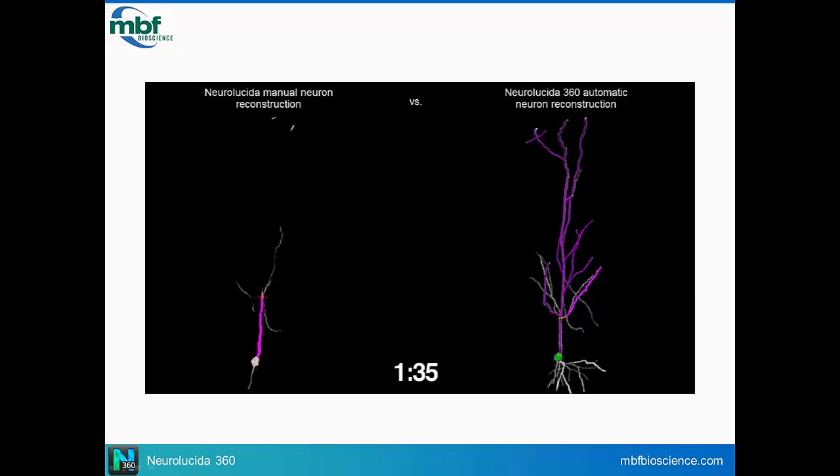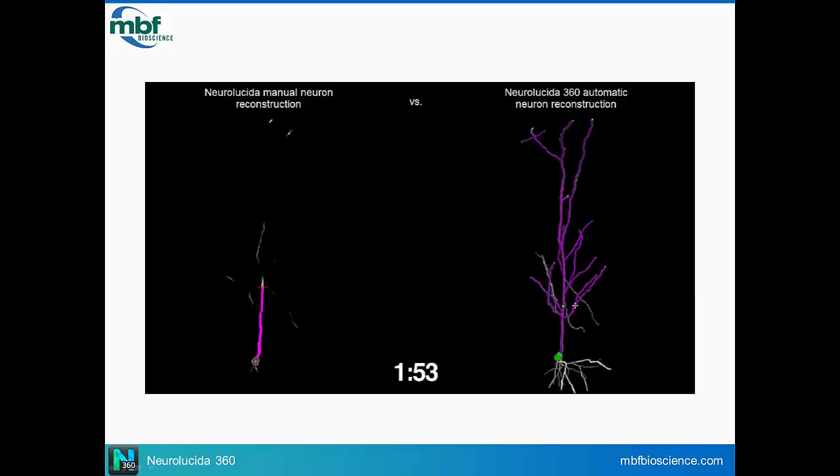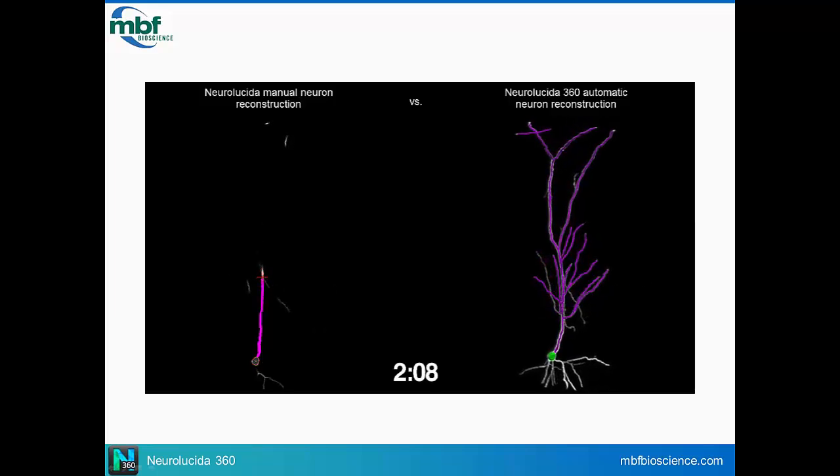It's a question by Jill about a technical question for tissue processing, whether the concentration of glutaraldehyde that we use has an issue with autofluorescence, and if they have to get rid of the autofluorescence for successful image acquisition. And we don't, with the amount of glutaraldehyde we use, we don't really see any issue. We don't have any issue with autofluorescence. I think you would have more of an issue with lipofuscin in this situation over the autofluorescence from the glutaraldehyde that we use.